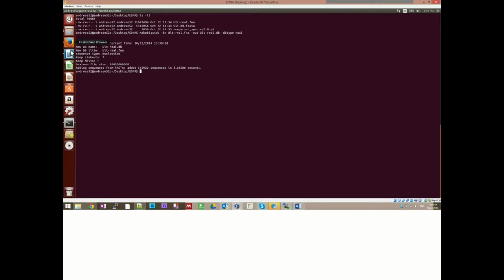And blast, usually, since I usually have lots of EPROBs. But in this case, I reduced the number of EPROBs to 10,000 to be able to fit into the time. But probably we're out of time. But I'm going to run it anyways, and I'll show you the output because I have some outputs from you if it doesn't work.